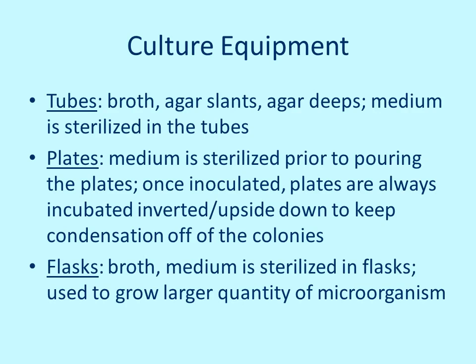Plates, the media has to be sterilized prior to pouring the plates. Once you inoculate a plate, you're always going to incubate it inverted or upside down. That keeps the condensation off of the colonies.